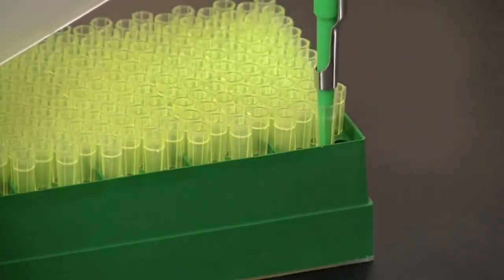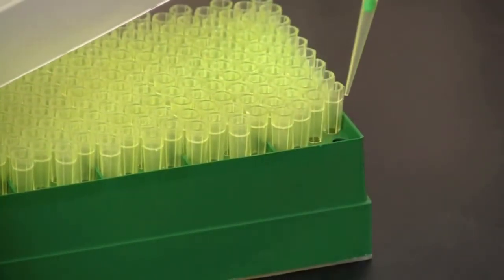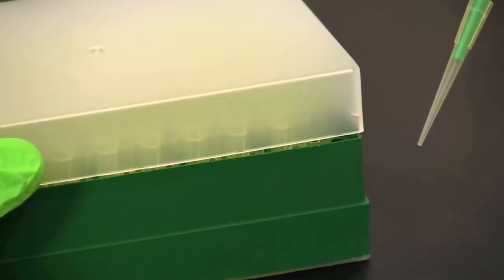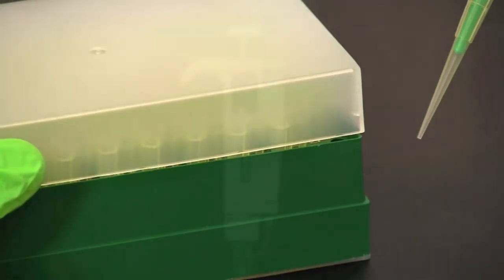After the correct volume has been set, place a disposable tip onto the pipette. It is important to apply gentle but firm pressure so that a good airtight seal is made between the pipette and the tip.